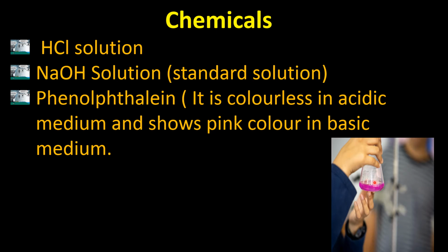But one thing which is very important is the indicator, which indicates whether the reaction has gone to completion or not.